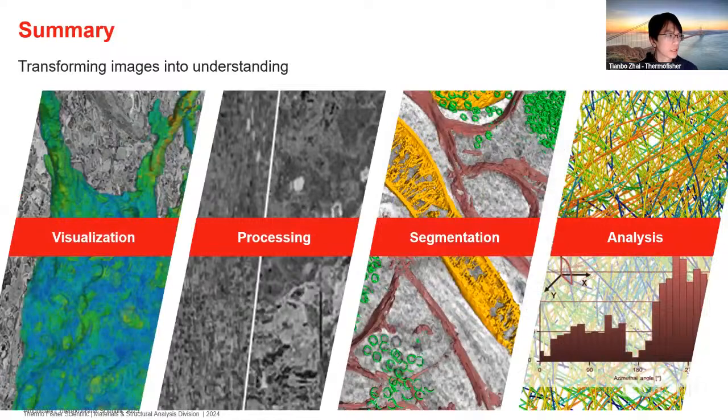To summarize this part of the session, consider AMIRA software as a standalone one-stop image analysis software. It helps you with visualization, helps you with pre-processing, and definitely is a big help to classify the image to be able to finish a good segmentation job.